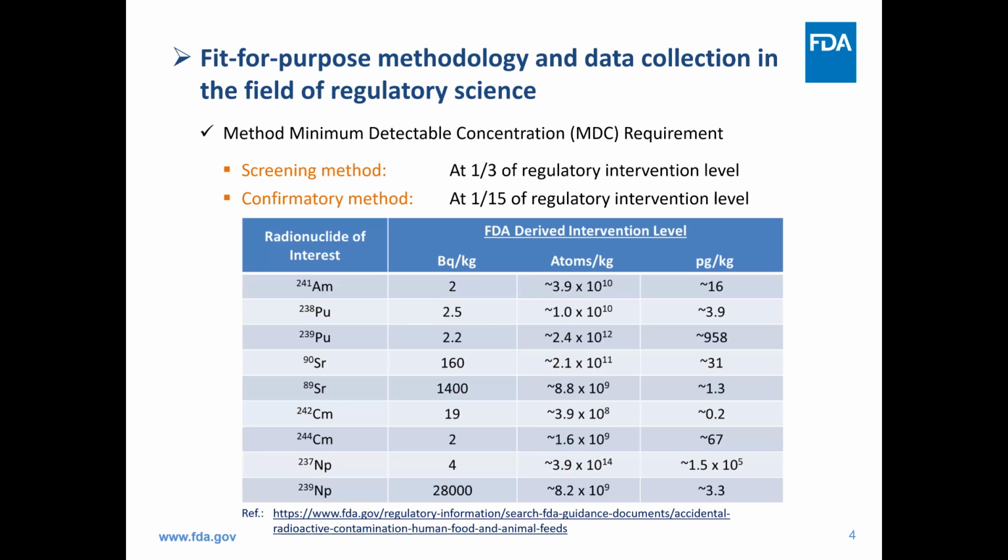Here is a list of radionuclides of interest and their respective regulatory limits, shown in the different concentration units used in radiometrics and mass spectrometry analysis.